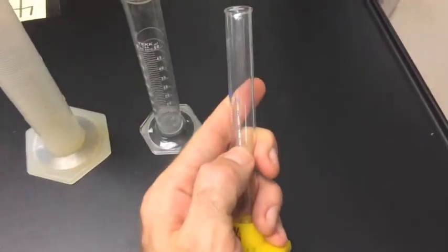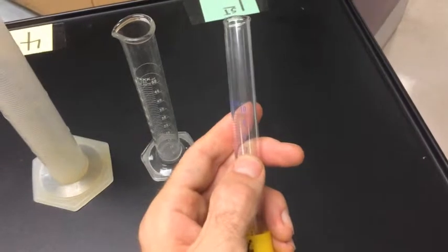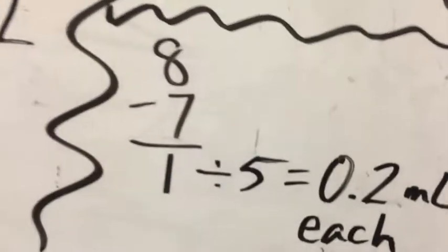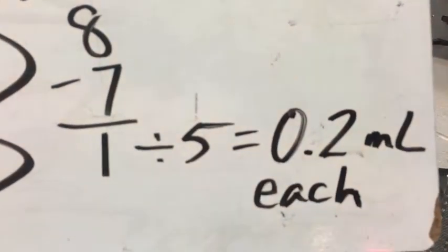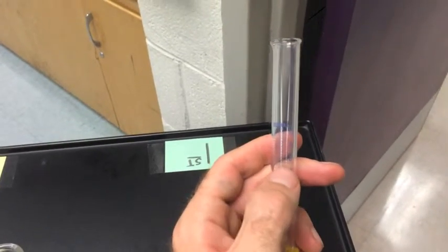The last one uses literally single milliliters, but there are graduations in between, so there'll be fractions. So I'm just going to pick 2 numbers. It doesn't really matter where you start from. I'll pick the 8 right here by my thumb and the 7 just below that. And in between, there are, again, 1, 2, 3, 4, 5 graduations from one number to the next. The math tells us 8 take away 7, that's where my 2 numbers on the graduated cylinder, gives us 1. 1 divided by 5, if you can't do that, calculators will be available, gives us 0 and 2/10 milliliters each. So those in between would start at the 7 and then go to 7.2, 7.4, 7.6, and so on, all the way up to 8.